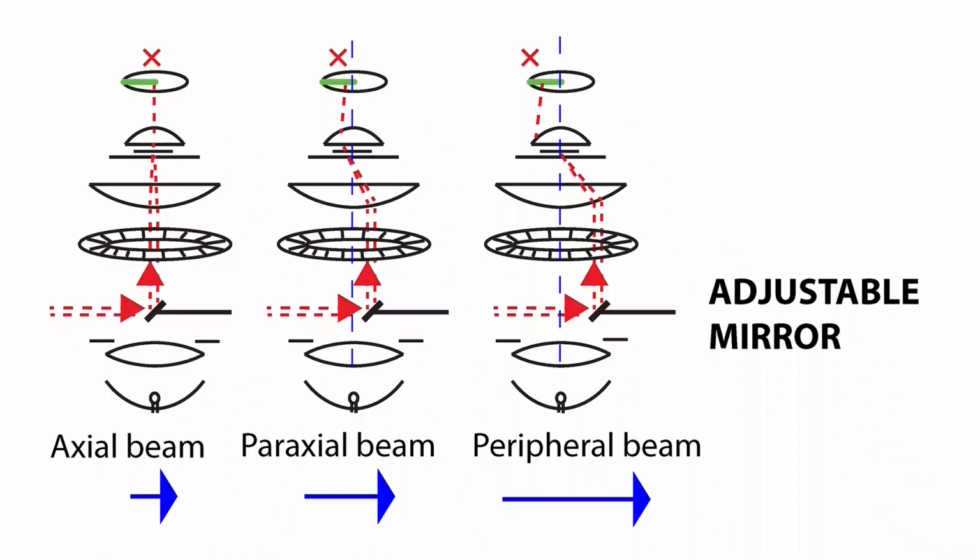The central or axial beam setting gives luminous appearance of internal detail, absence of typical bright edges seen in conventional dark field, and it gives deep field suitable for thick samples. In the peripheral or edge position, the resolution is doubled in one direction. The depth of field is relatively shallow, and the asymmetry generates a relief contrast.